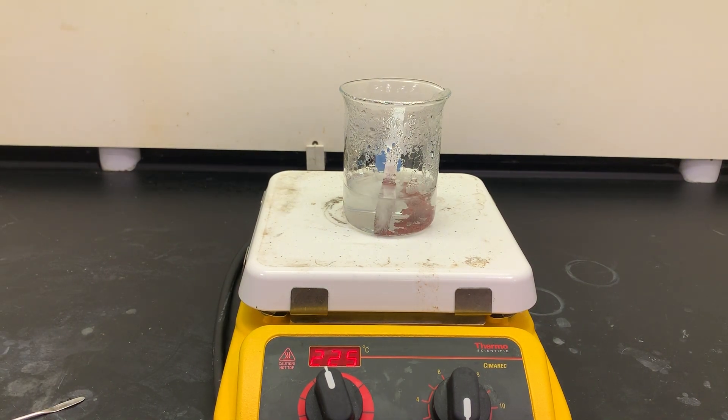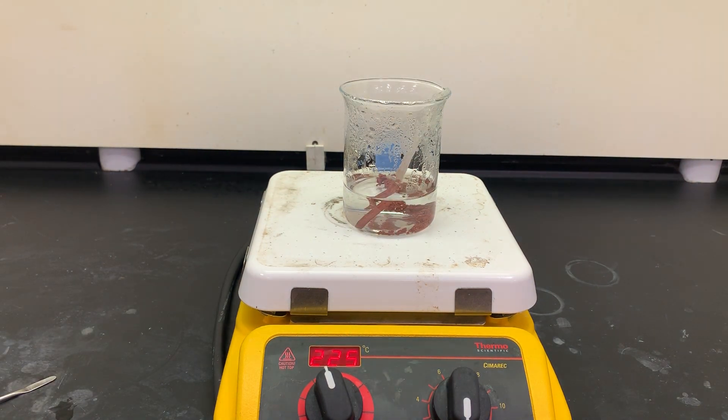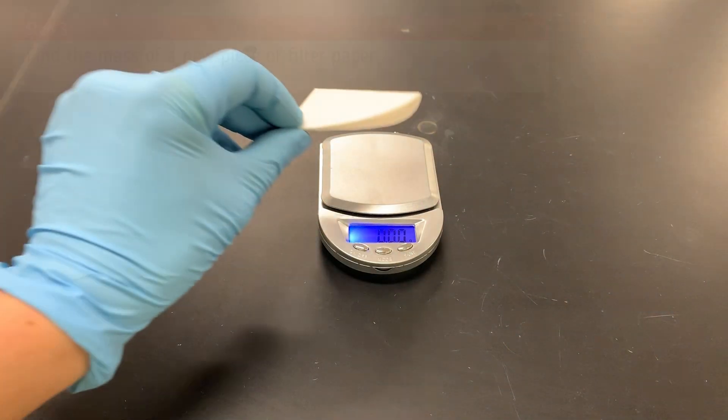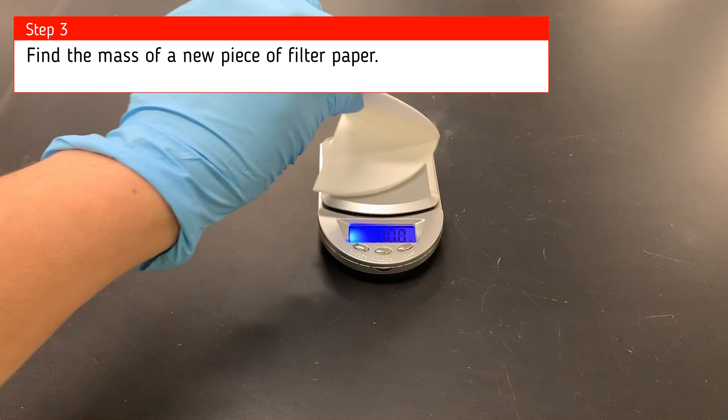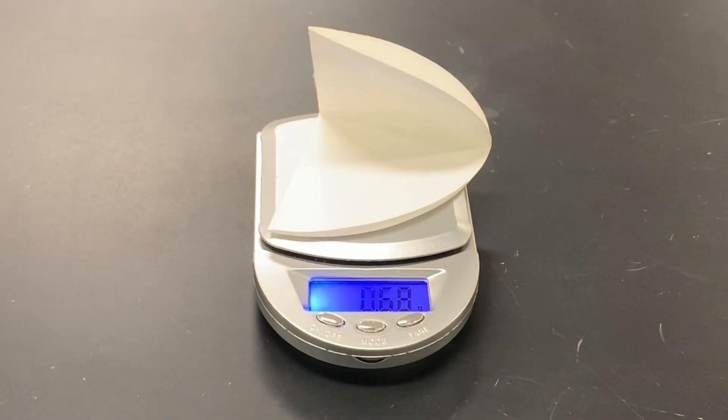This reaction is just about done. We are actually going to head over and measure the mass of a piece of filter paper, because ultimately we are going to filter this copper out. So I'm going to put a piece of filter paper on a balance and record the mass of just that filter paper.